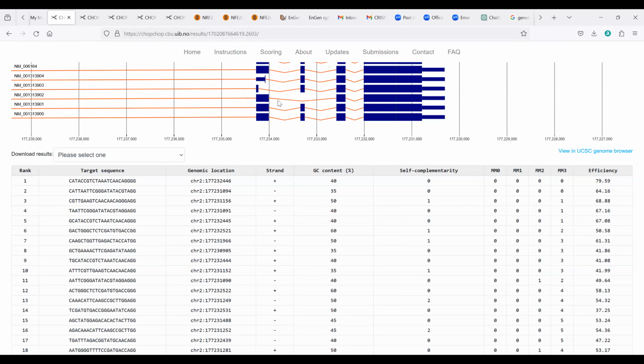But if you end up editing the last exon, the significant portion of the protein will be formed, and only the tail region of the protein, the C termini of the protein, may have some change. Okay. And so the protein will still be functional. So that means you have not achieved a knockout. So in order to do a knockout, particularly for genes with multiple exons, you need to target the initial exons, either exon 1 or exon 2, instead of the last exons. For example, like this gene has 5 exons. Okay, we need to target the initial exons.